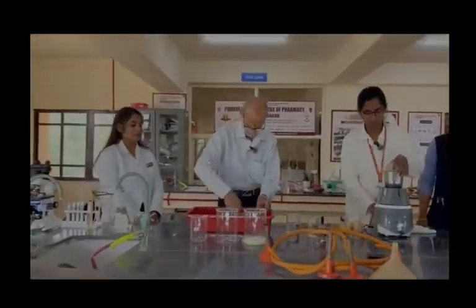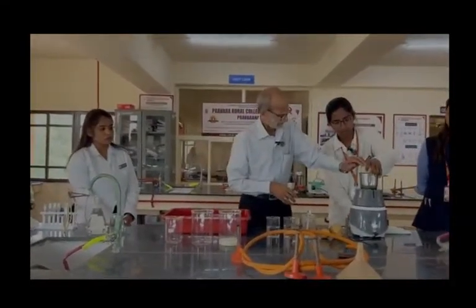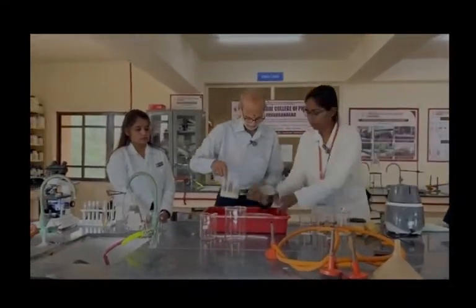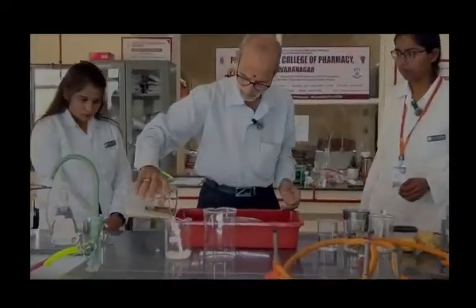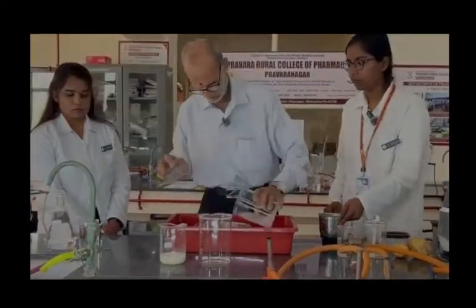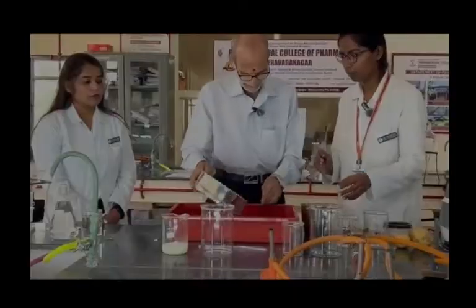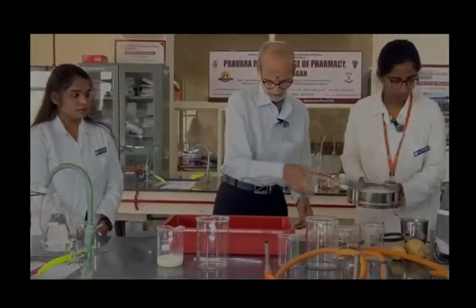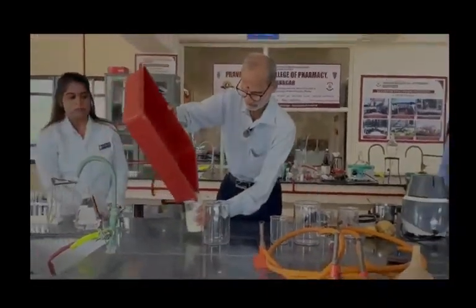Do add some amount of acid in that. Normally citric acid is the one which is used so that it doesn't lead to the browning of the starch. Otherwise you will get not white but brown color starch. Okay, so now you can see, we will discard this. The starch will slowly get deposited at the base. It is heavier than water, and it will form the lower layer in the beaker.